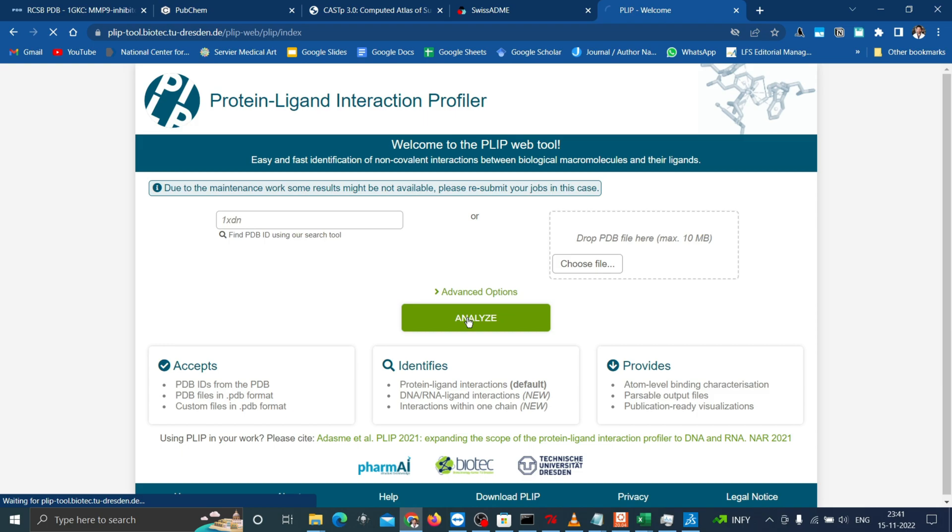Moreover, the advanced options in the input section allow the user to modify the default settings of PLIP according to their special requirements such as adjustment to thresholds for the detection of interactions, consideration of modified residues, specification of which model to use in multi-model structures, the detection of intra and inter chain interactions and the treatment of nucleic acids.